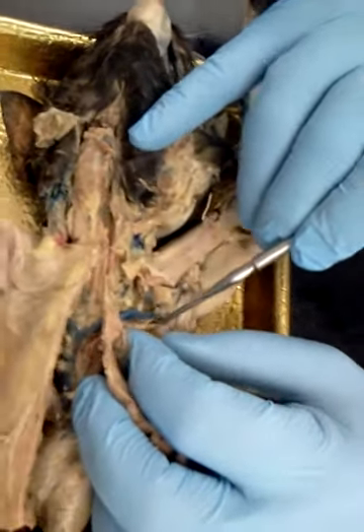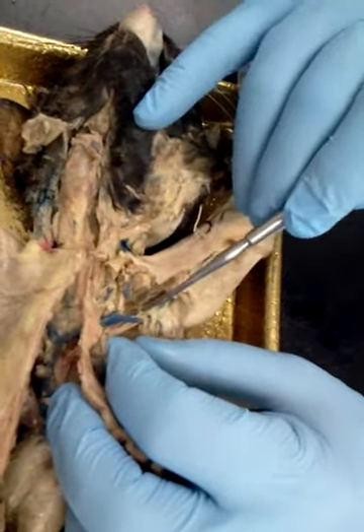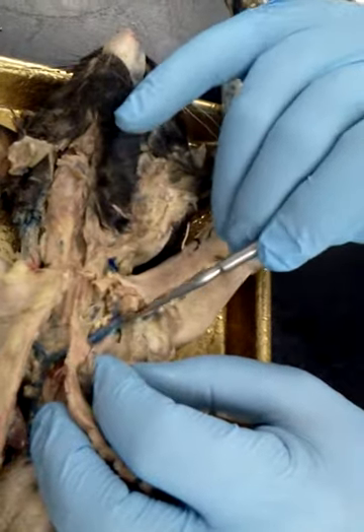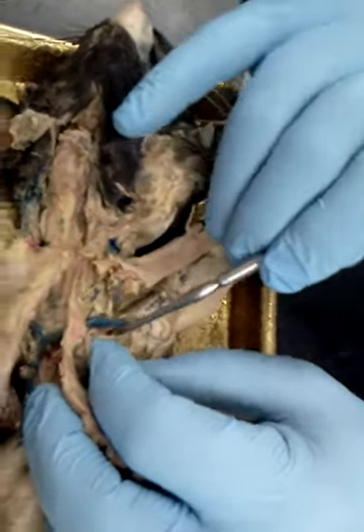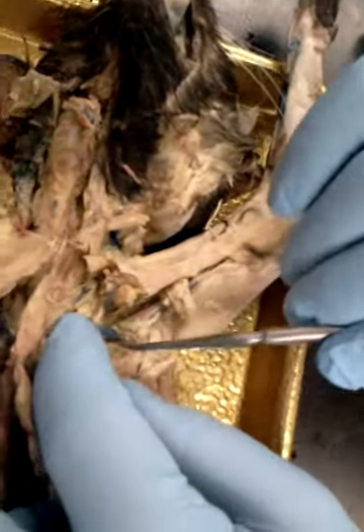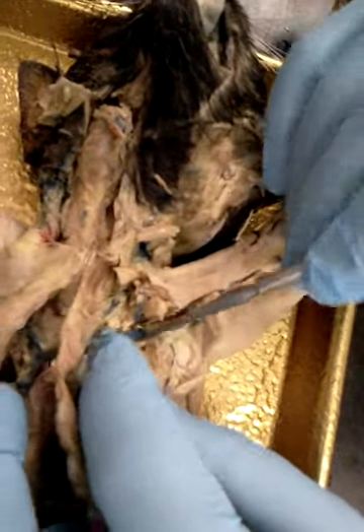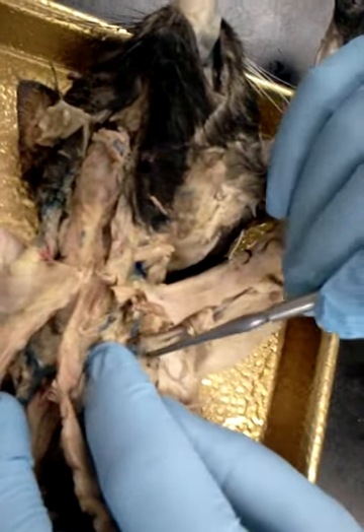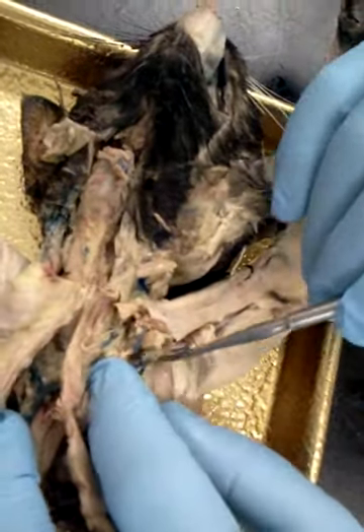And then that is going to branch down to the subscapular, which will go down to the shoulder blade. I'm going to get those confused. Okay. The subscapular. It's going to be difficult to see. Still got too much tissue around it. But it's this artery that goes down to the scapula.